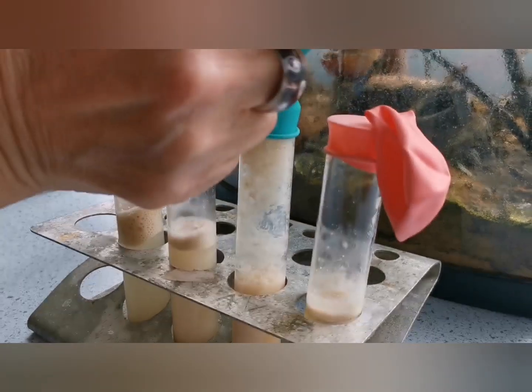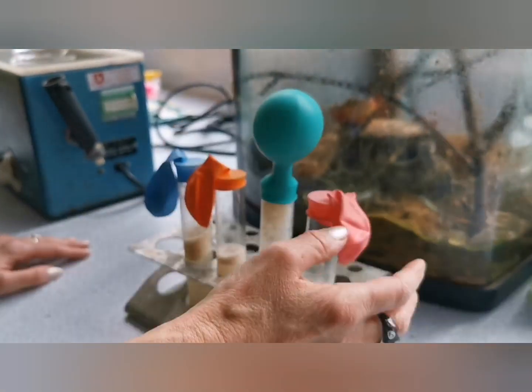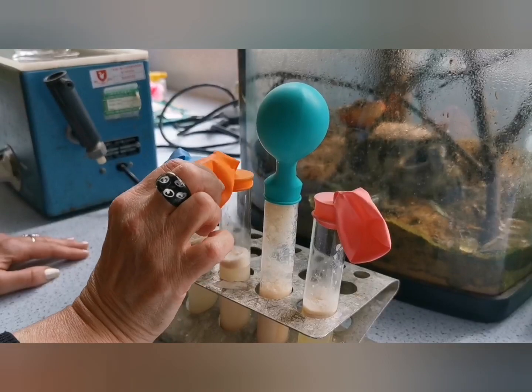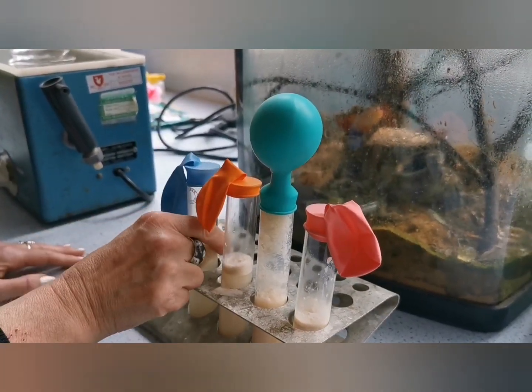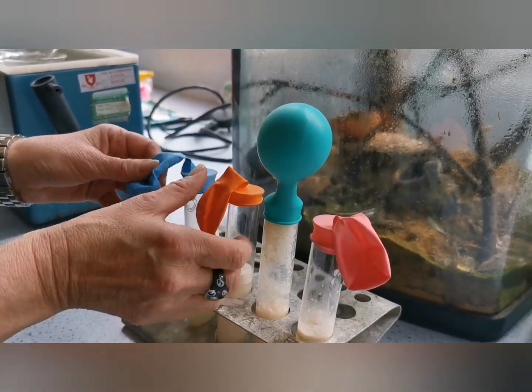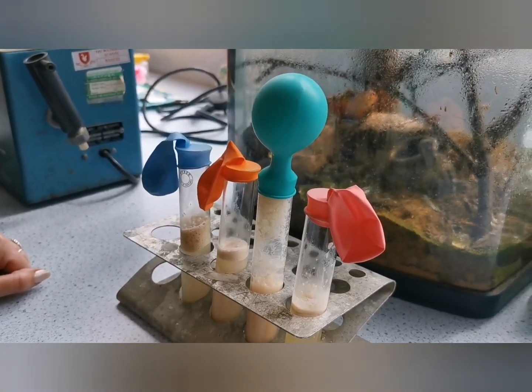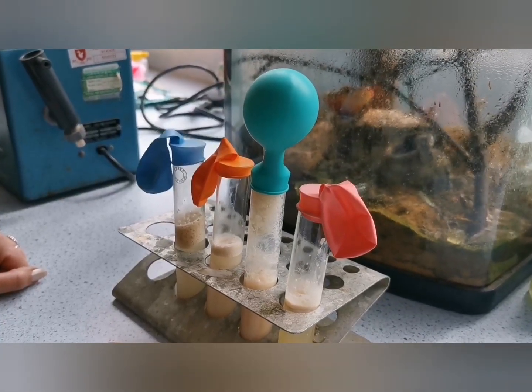So obviously if we left this all day, this is actually quite firm, and we can compare, obviously no gas at all really in here, very few bubbles going on at all. More bubbles in this one. This is our 20 degrees, and then in our fridge version there were some bubbling going on there, but actually very little has gone into our balloons. So our most successful was our 40 degrees, which is the optimum temperature for fermentation of a yeast.